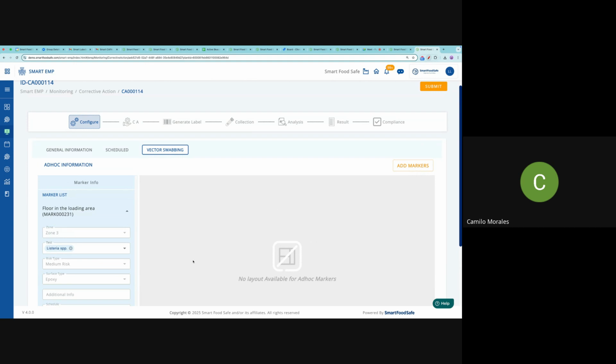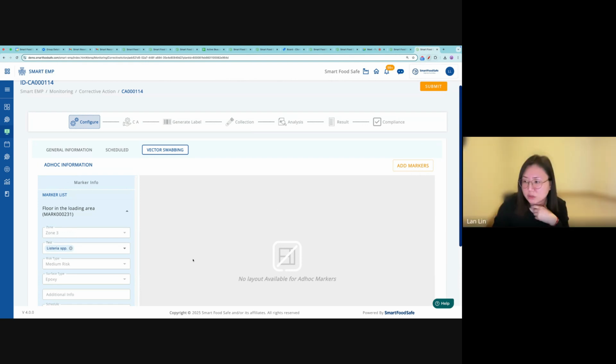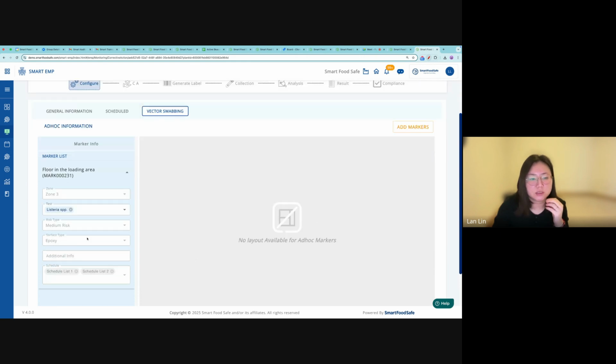This module only works for environmental sampling, or for example, does this work for food sampling? No, it's not designed for that. When you select, for example, the zones, you will notice you have only the option for zone 1, 2, 3, 4. Those are the categorization of the surfaces, the equipment or the floors. And you also have the water and air. That's also part of the environmental monitoring process. But you're not going to do any food analysis in this module.